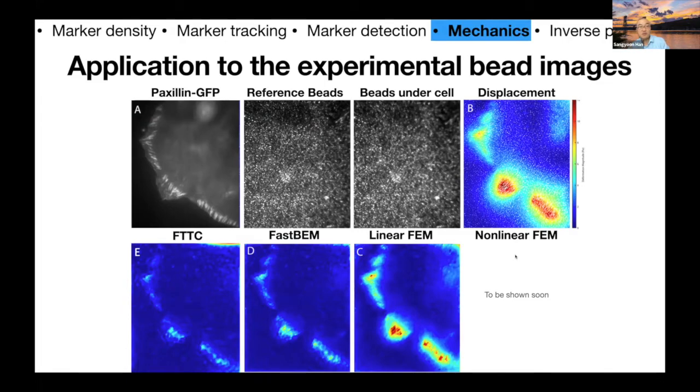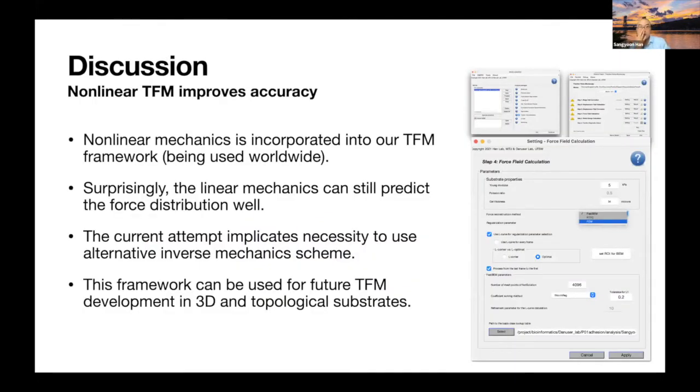But the best thing I want to tell you here is that this nonlinear mechanics framework has been incorporated into our TFM framework. Currently, something called the TFM toolbox, or package, is being used worldwide. There have been many citations of this method and software.